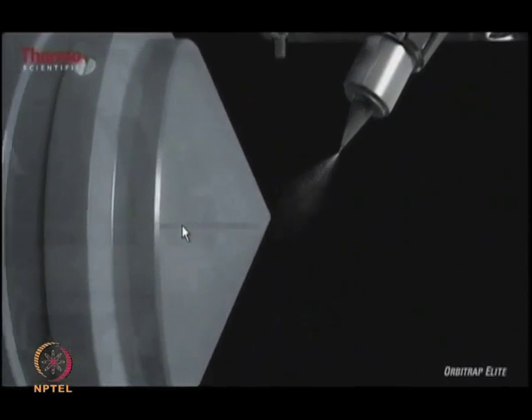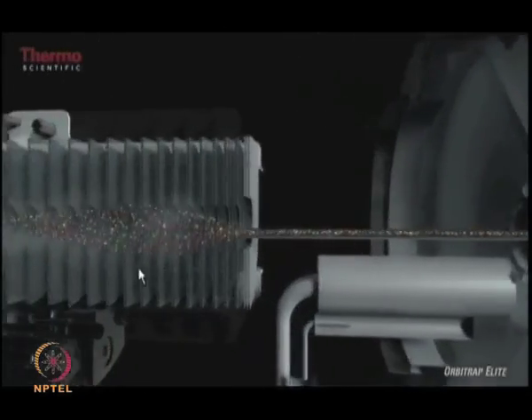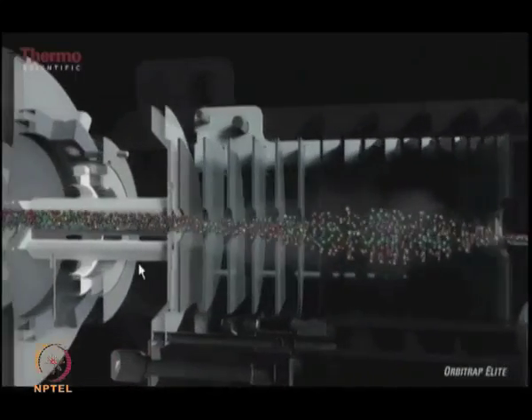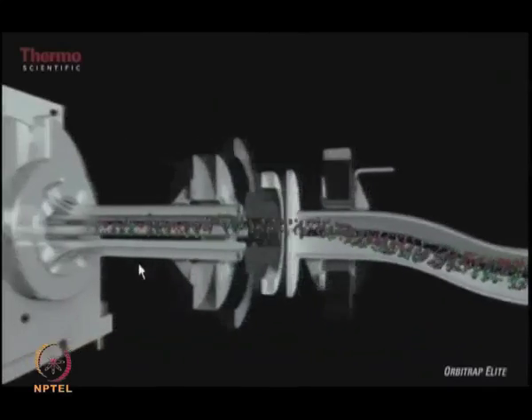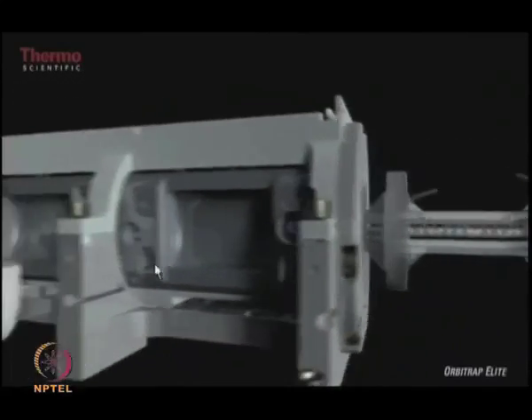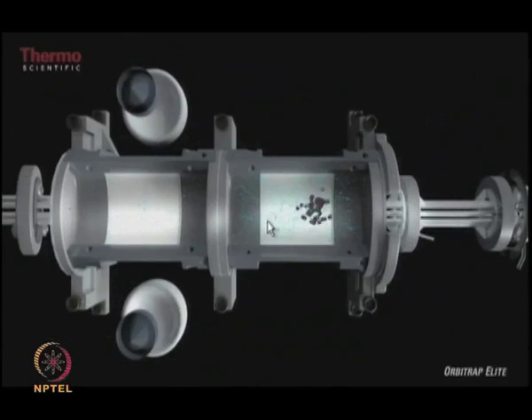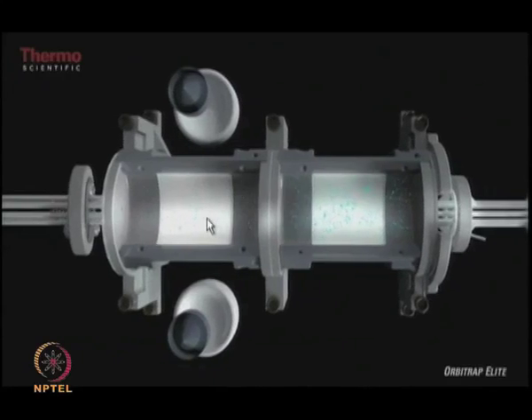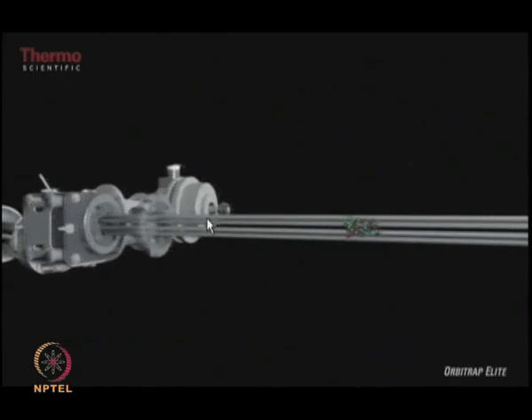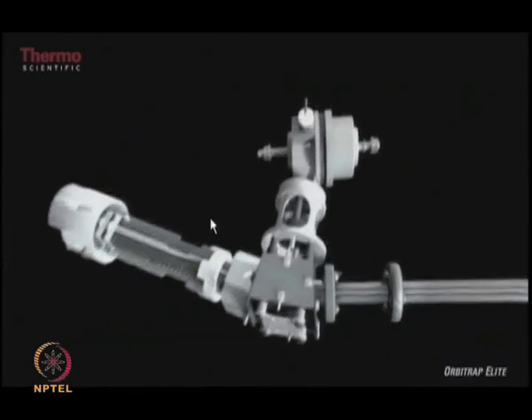So coming back to the ionization source, the ions are generated from the source and go into the transfer optics, and after going out from the transfer optics they go to the linear trap. In the linear trap, in full scan mode, the ions are stored in the high pressure cell. Once the ions are stored there, they are then transferred to the C-trap through the ion transfer optics.